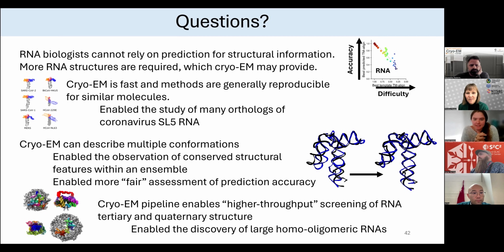From experience, the main one, biophysically, that seems to be dictating it is simply motion. For example, those four helices: you can imagine the ends of them can drift, and that causes very low resolution. If we were to focus on the junction, for example, it would resolve better if it was larger.